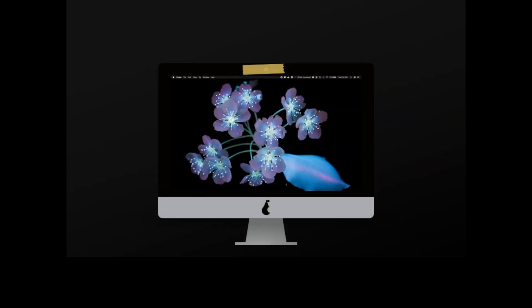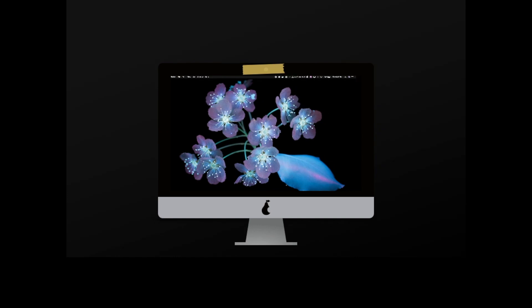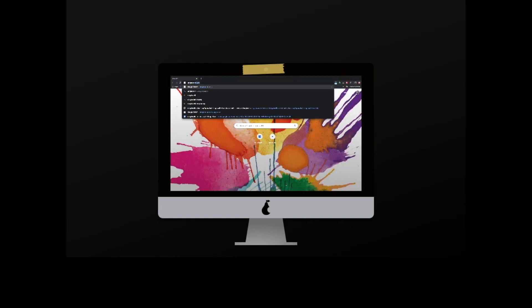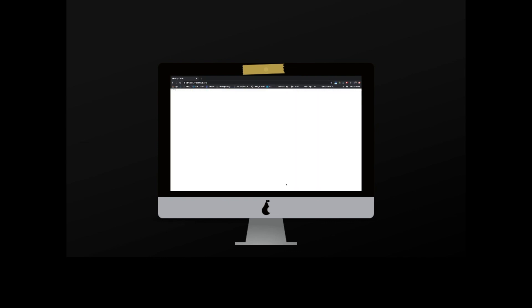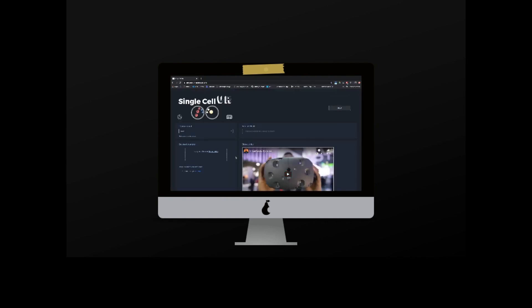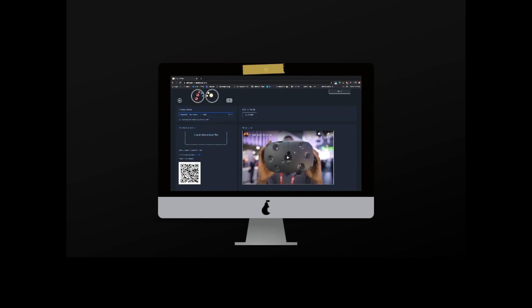We have created a companion package with a convenient one-command data conversion tool. We'll show you how that works in a subsequent video. For now, let's navigate to the website. One can simply upload their data to the web browser and jettison it to their phone using the QR code generated in the bottom left corner.